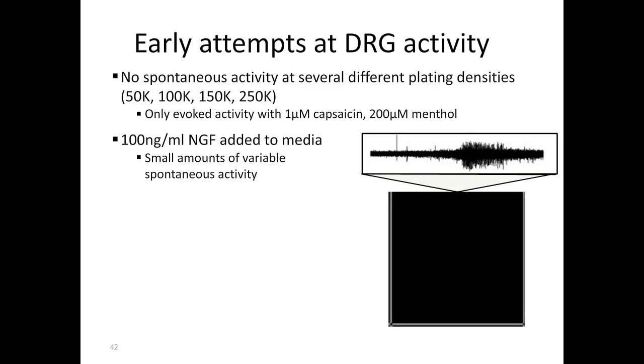So this wasn't a very good assay at first to try to test the effects of different compounds. And so we wanted to work on developing this assay so we can get robust spontaneous activity. And I'll walk you through the next few slides what we did to recreate that.